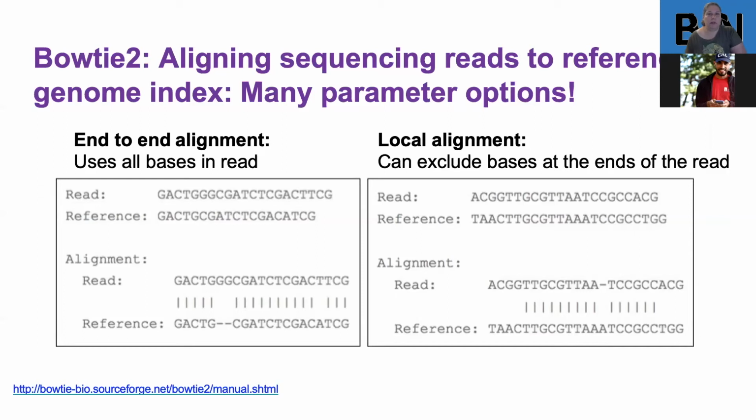There are pluses and minuses to each approach. Most of the aligners, I think, use end-to-end by default. Luis, do you agree? Yes. Cool. All right.